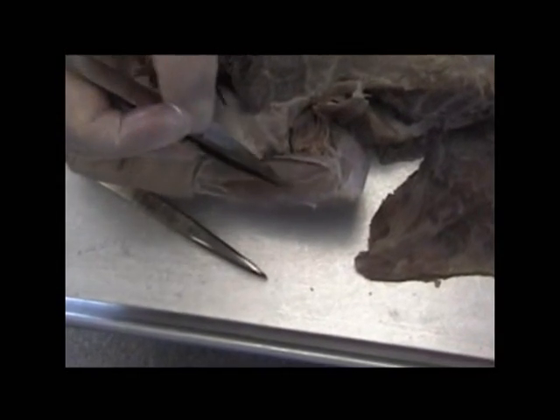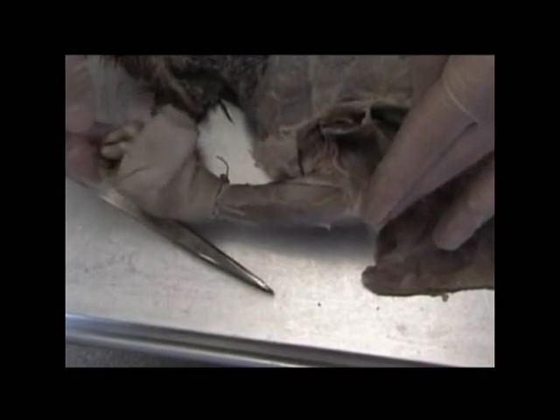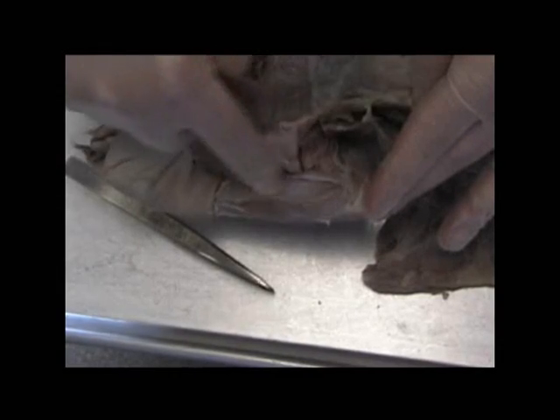Biceps brachii. If we work our way out then onto the antebrachium, or the forearm, we have a set of four muscles that run here, that are coming down and articulating on the paw, and they will pull the paw inward when they contract. And we refer to these as the flexors. Flexor group, running down this way. Okay, we're going to stop here and turn the animal over.